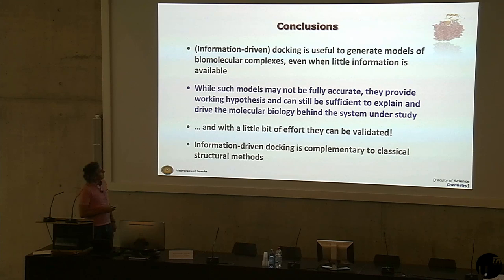What we are doing in all the modeling that we are doing, we're generating models. You should also realize that everything which is in a PDB, even all the crystal structures, they are all models. There is no single structure of a protein in a PDB which is not a model. Some of them are more models than others. Even in crystallography at high resolution, the bond lengths are defined by the model. The angles are defined by the model. So there is always a bit of modeling going into any experimental crystal structure, NMR structure and cryo-EM structure. So everything is a model. Some are more model than others. So the models are not going to be fully accurate, but they are valuable to generate hypotheses. And with these hypotheses, you can go back to the lab, do experiments, and test the model. So in that respect, information-driven docking is very complementary to classical structural methods.